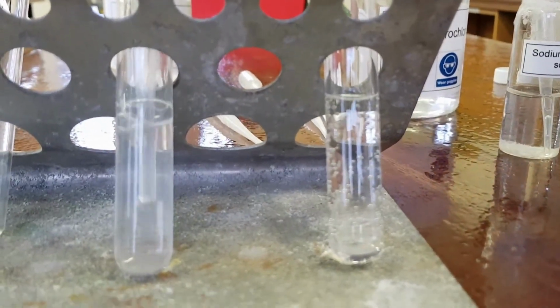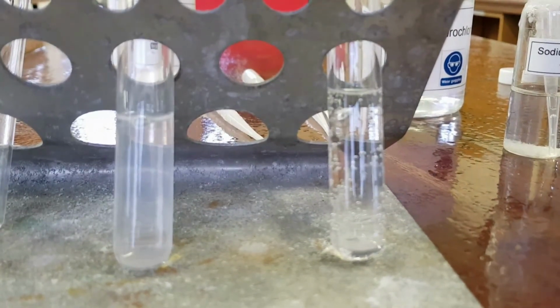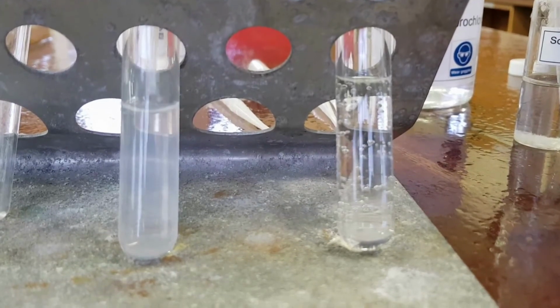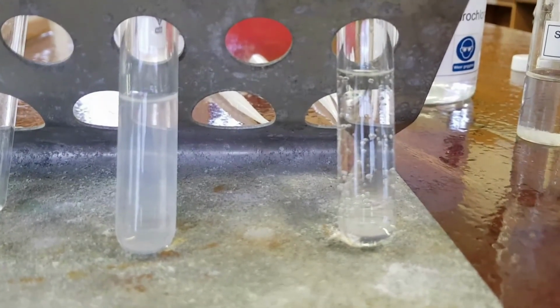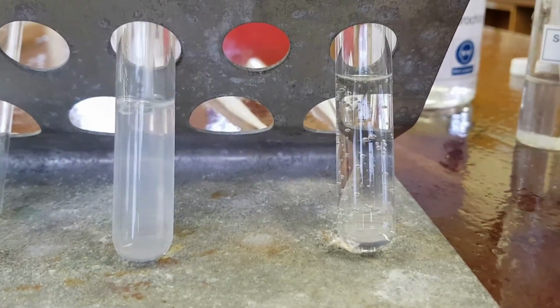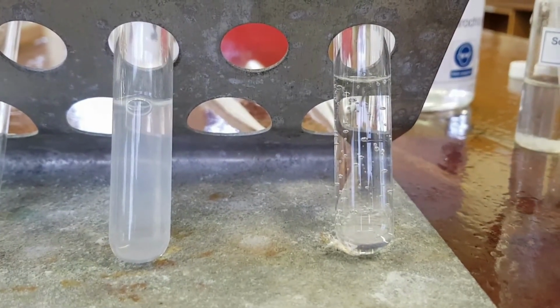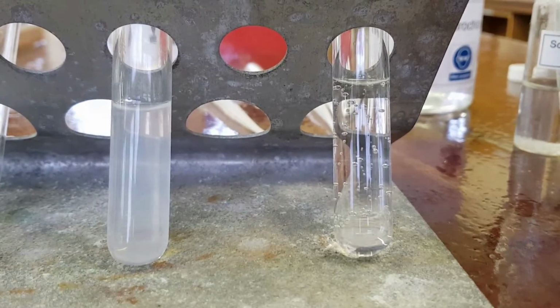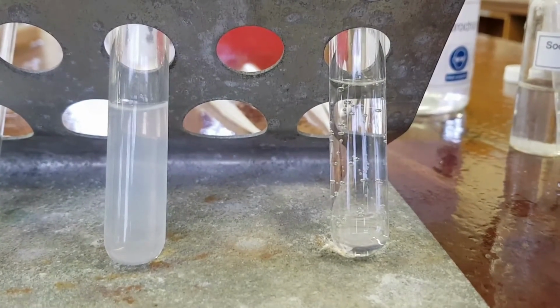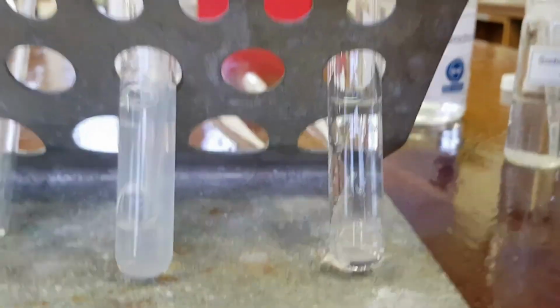Notice he's not going into the solution, he's sucking the gas from the top of the test tube, and the test tube on the left, the lime water, is going unmistakably cloudy here, indicating that carbon dioxide is being produced in the test tube on the right, and that is how we test for carbonates. Thank you very much, Mr. Reeves. Again, my pleasure, Dr. Nixon.